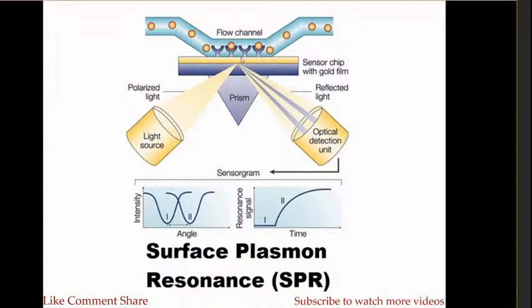It's a sensor based technique. Using this surface plasmon resonance, we can develop sensors. It's a gold chip. This gold chip is coated with peptides. These peptides are specific for the antibodies. This immunological antibody technique is used for the coronavirus detection kit. So I have included this image for the surface resonance spectroscopic method.